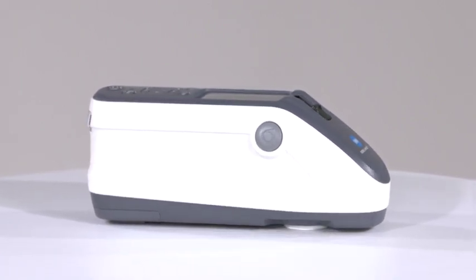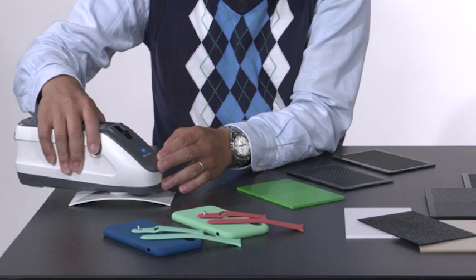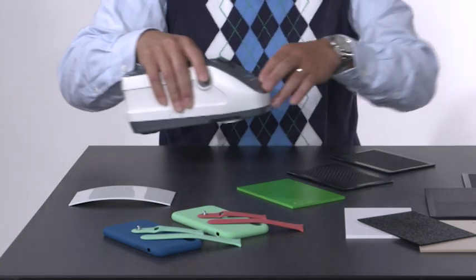With its lightweight ergonomic design, optional Bluetooth, and high-resolution TFT color display, the CM26D is perfectly suited for applications in the field, production line, or the lab.